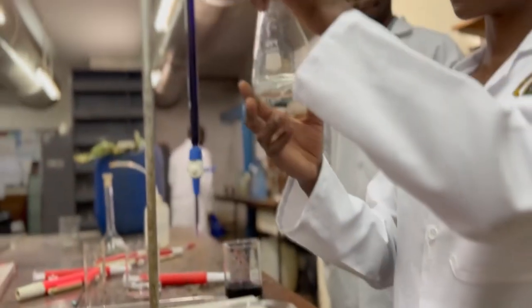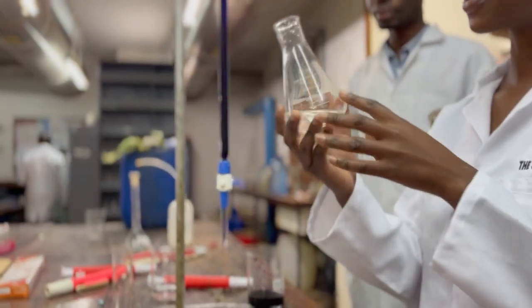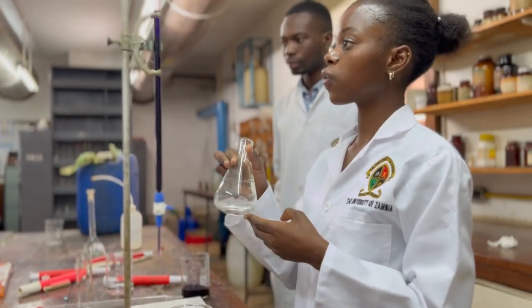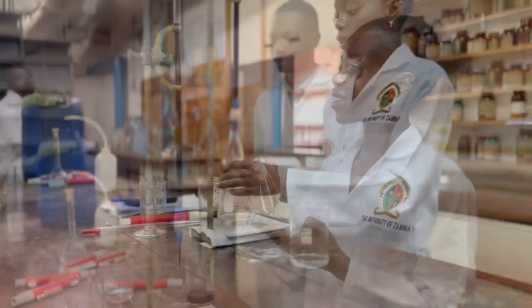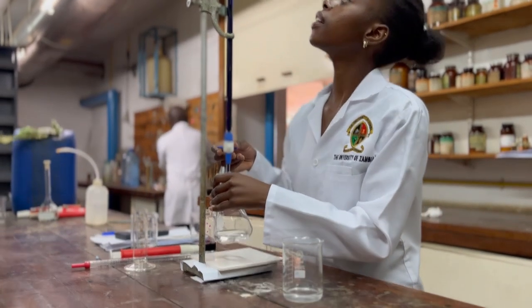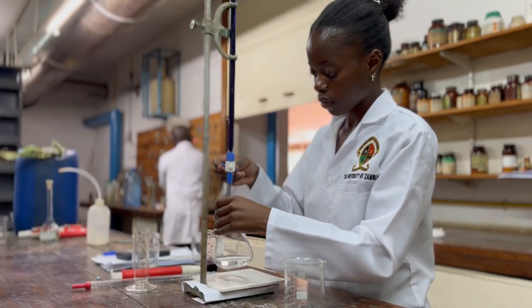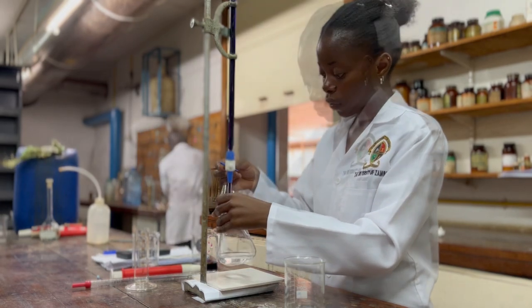In the conical flask we have the iron(II) sulfate mixed with sulfuric acid, in order to prevent oxidation of the iron(II) sulfate. We can now start the titration. As mentioned earlier, we're recording the volume from the upper meniscus because the solution is colored, and making sure that our eyes are focused on the conical flask.